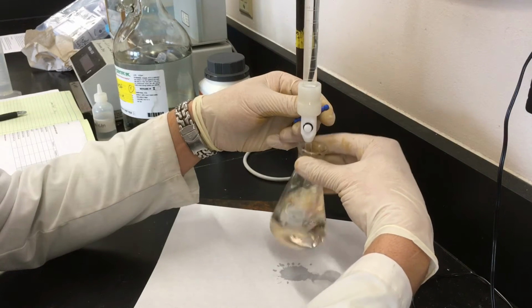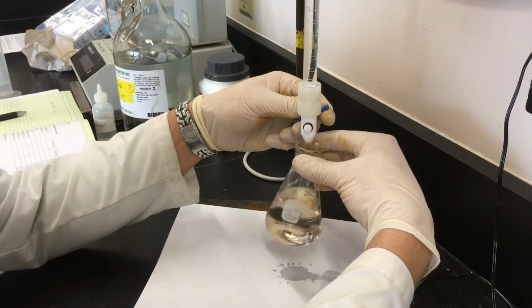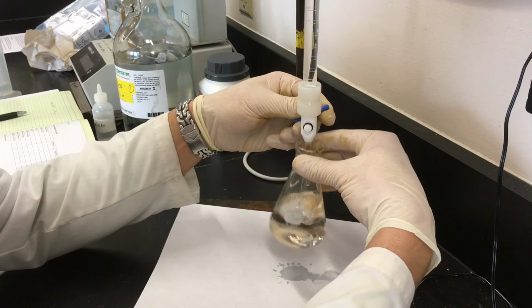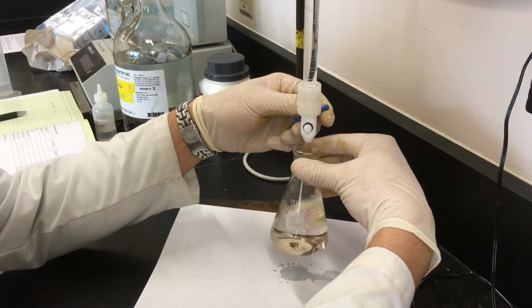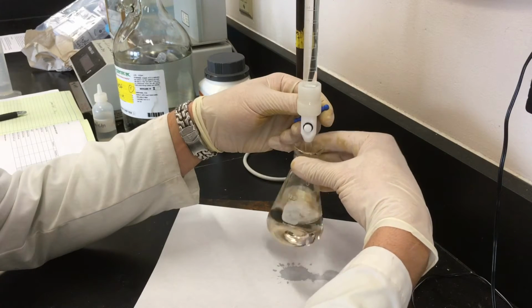You probably can't see this in the video, but at this point I have it dropping, drop, drop, drop, drop into the solution. I want to know exactly what the one drop is that's going to create a permanent color change.